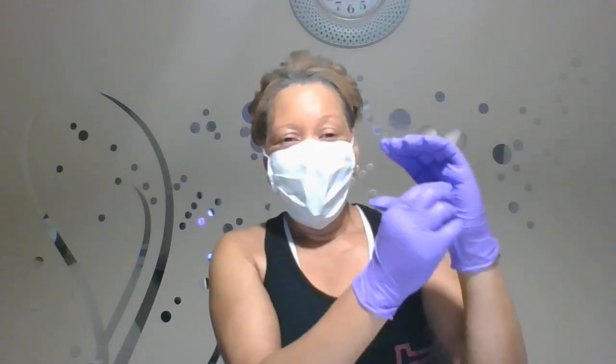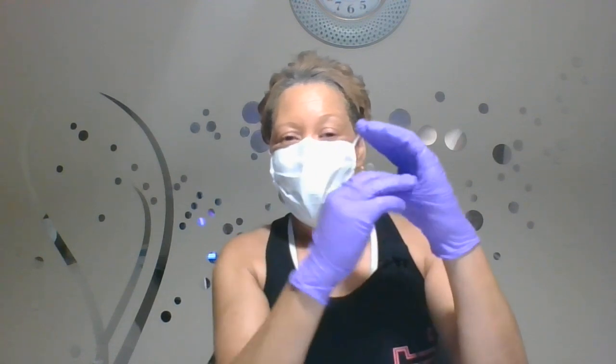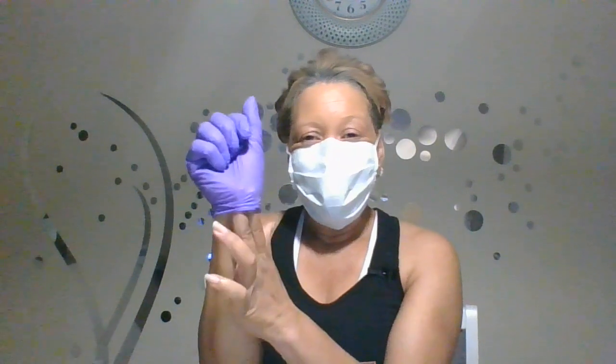Now we're going to remove the PPE. To remove your gloves without self-contaminating, make a C-shape with one hand to create extra room in the middle of your palm. Grasp the outside of the opposite glove from the middle of the palm and remove it, balling it up. Then use one to three fingers to go underneath the remaining glove on the inside — without touching the outside, which is contaminated — and pull it off. The inside of the glove is considered clean; the outside is considered dirty.